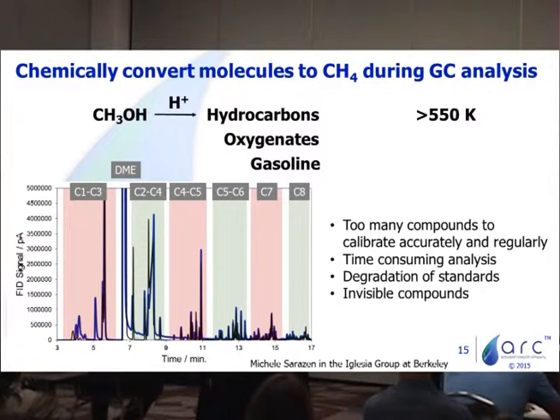We could also group these peaks into C4, C5, C6 lumps and get an entire concentration of that lump just by integrating that, co-eluting peaks and all.